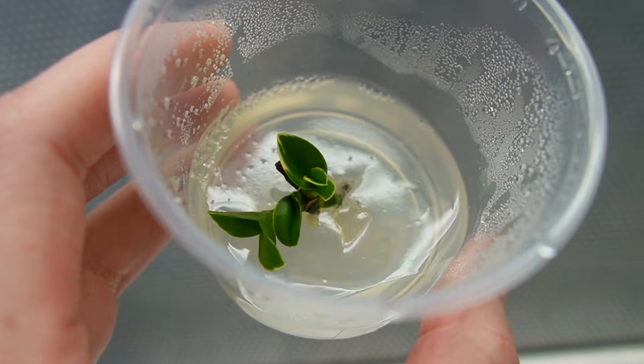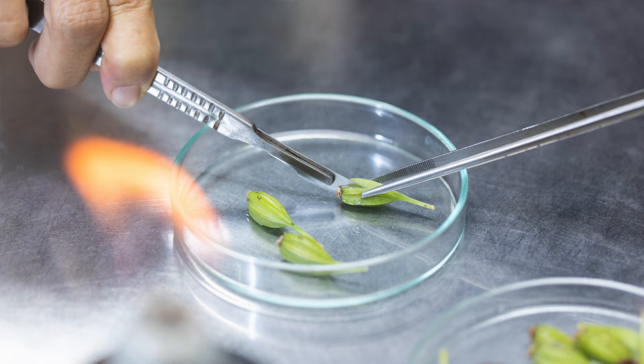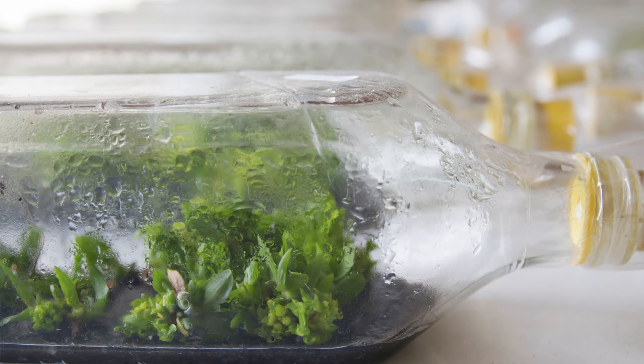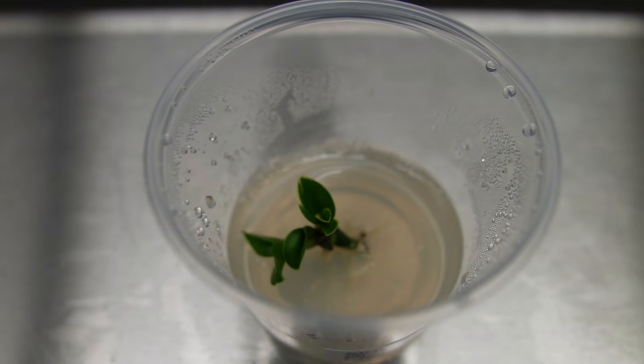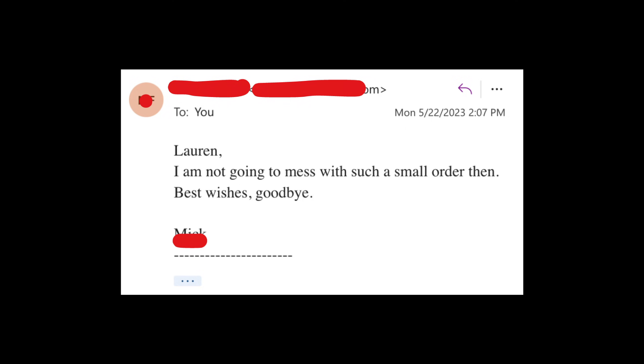My variegated Phalaenopsis orchids are also doing really well — the variegation is starting to show, which is fun. Orchids are typically grown from seed and those seeds are typically germinated aseptically in tissue culture, but that's not what I did in this instance. I actually used nodal sections of the flower stock for my tissue samples. I've never tried growing orchids from seed but it is something that I would like to do someday. The last time I tried to buy orchid seeds from a small seller, orchid communities basically just ran me off the internet, so I've been looking for a seed pod to use.